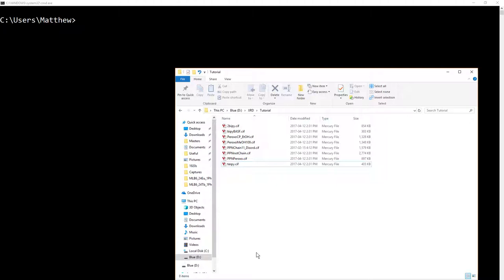The first thing is the Cambridge Crystallographic Data Center does not recommend you combine your CIF files before uploading them. Apparently there's occasionally issues splitting them back out into multiple files for inclusion in the database.